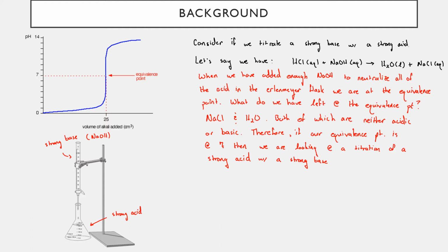And when we go to the other side, past the equivalence point, the curve is moving in a clockwise fashion. And so when we see this curve change its curvature, that is called an inflection point. And that's another way that we can recognize where that equivalence point exists.